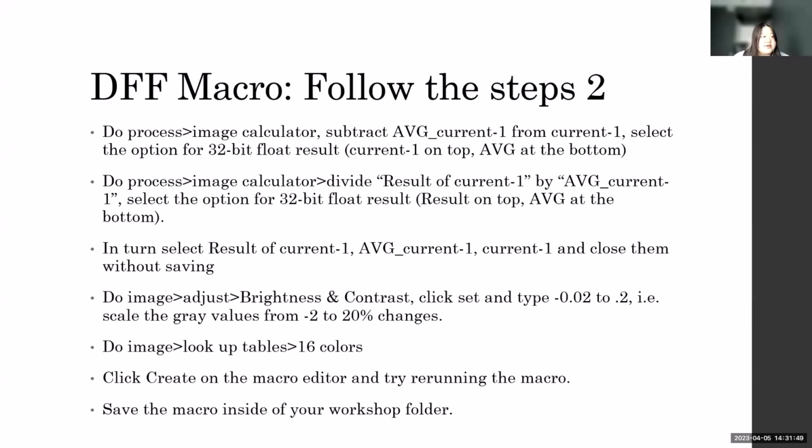Okay, everyone, for the interest of time, I'm going to be moving on to the batch processing. But like I said before, all of these slides, the PDF versions of them, are on our OSF page.